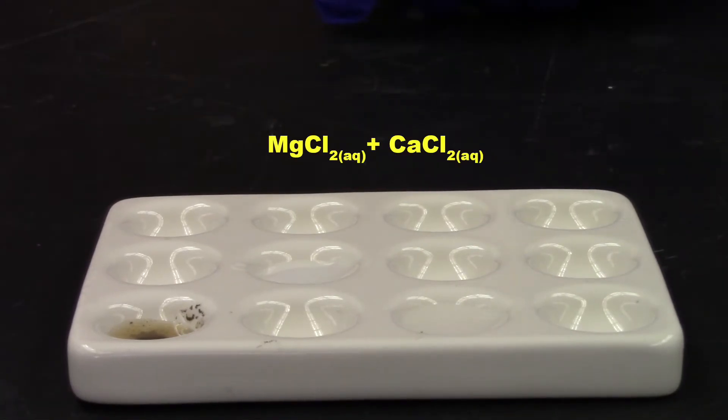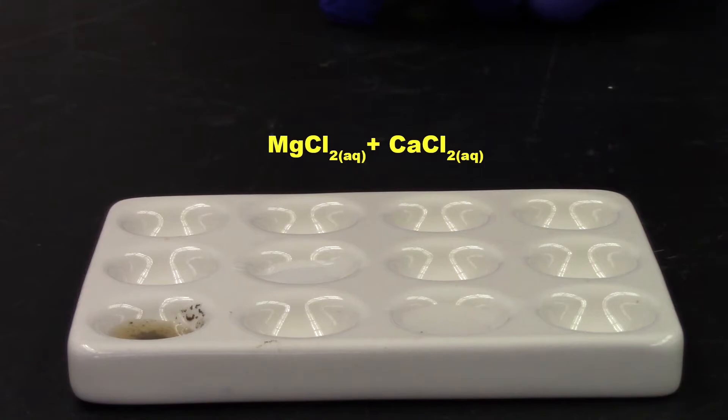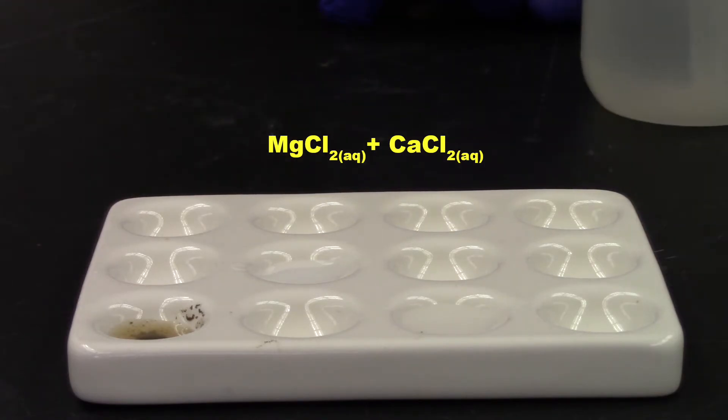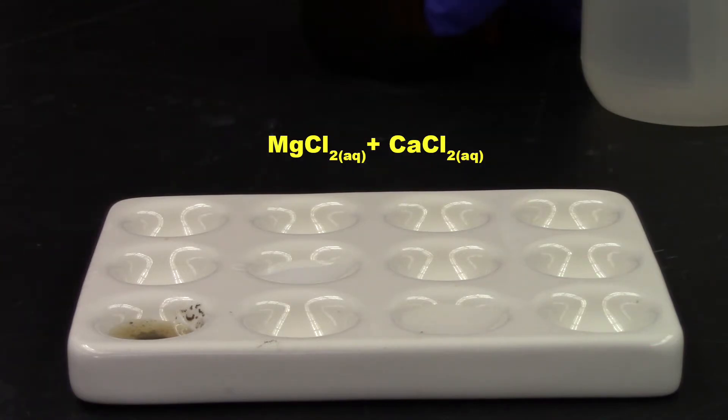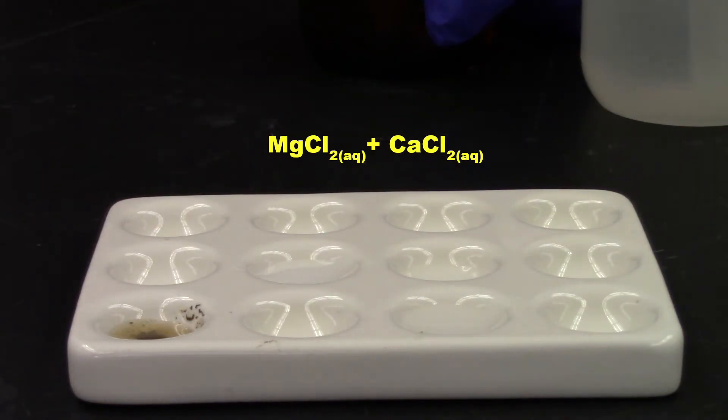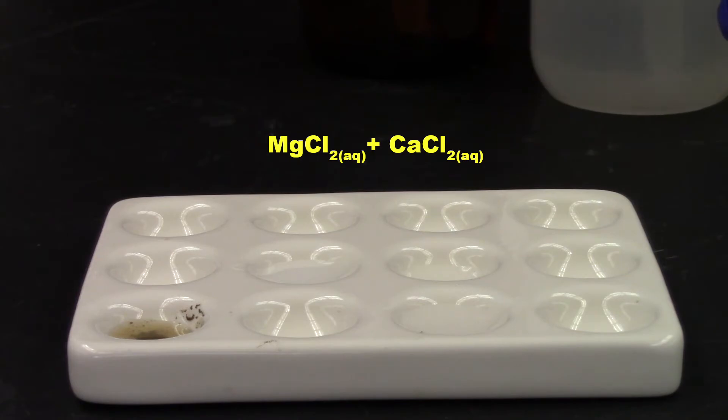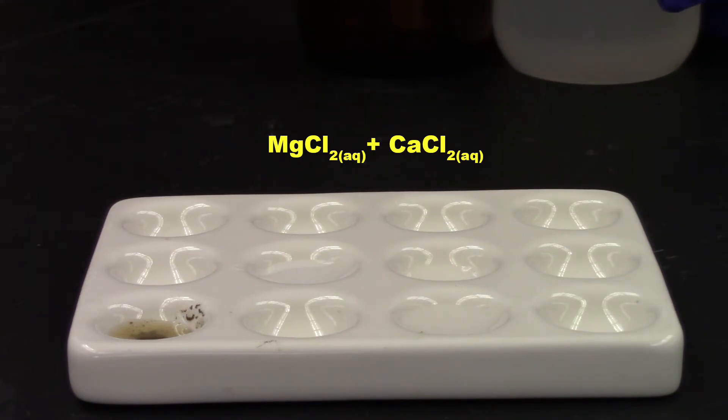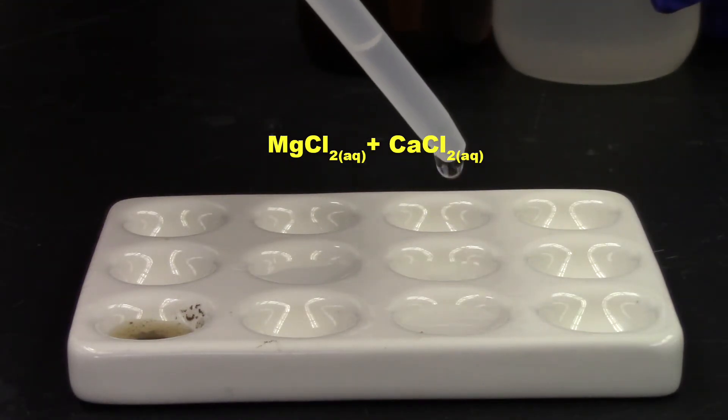And last but not least, we're going to put magnesium chloride and calcium chloride together and see what happens. And we'll do it right here. So here goes the magnesium chloride, a clear, colorless liquid. And here comes the calcium chloride, another clear and colorless liquid.